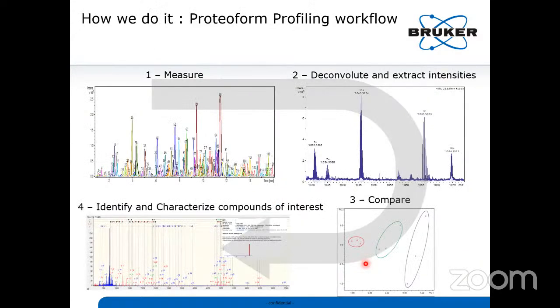These are the different steps for confirming. This is an LC level chromatogram, where it will be labeled with different site positions. From there, deconvolution. Below you can see, for every peptide, the Y ions and B ions, and you can compare them. It's a complete one-chain structure.